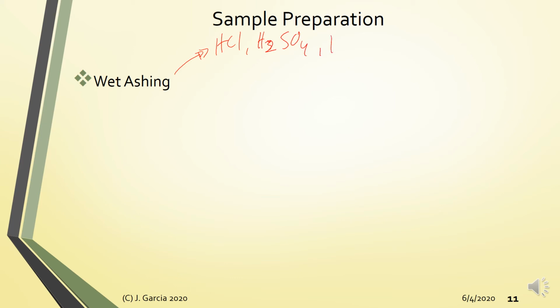Sometimes you need to use hydrofluoric acid if you're dealing with silicates, or sometimes mixtures of acids, such as nitric plus sulfuric, or sometimes aqua regia.